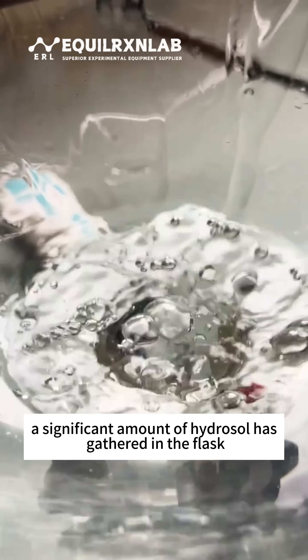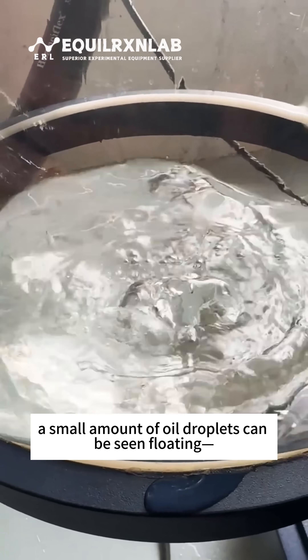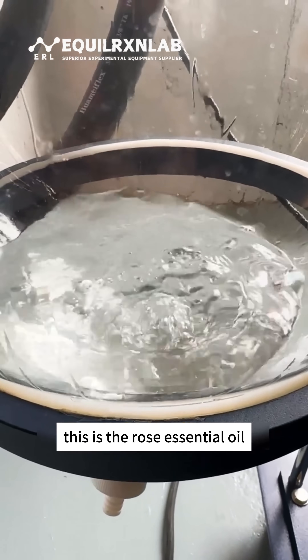After a period of distillation, a significant amount of hydrosol is gathered in the flask. On top of the hydrosol, a small amount of oil droplets can be seen floating. This is the rose essential oil.